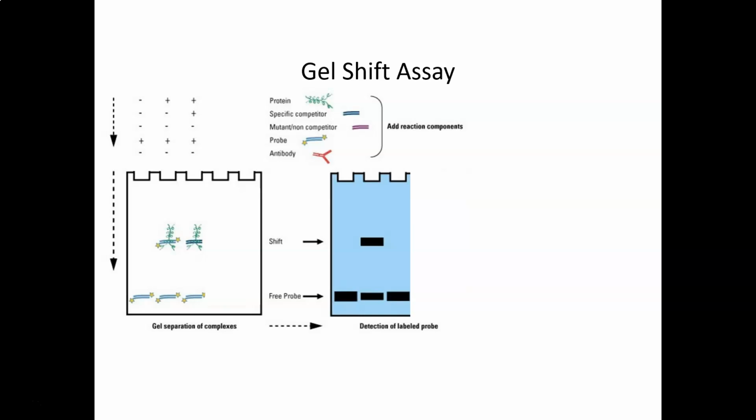But a critic can come up to you and say, at this point, all you've really proven is that your protein binds to DNA. What if your protein is just overall positive charge and it's sticking to DNA non-specifically? It'll stick to any DNA. Because essentially what you've shown me here is that if you add labeled probe DNA, your protein sticks to it and shifts it up. And if you add unlabeled excess DNA, you can lose that shift, but your protein's just sticking to DNA.